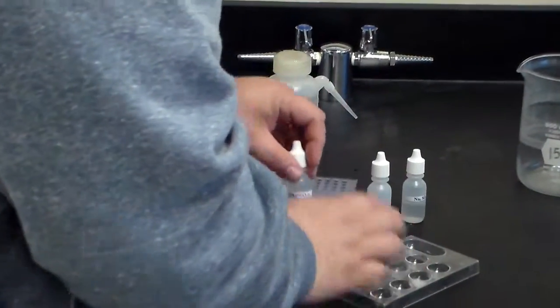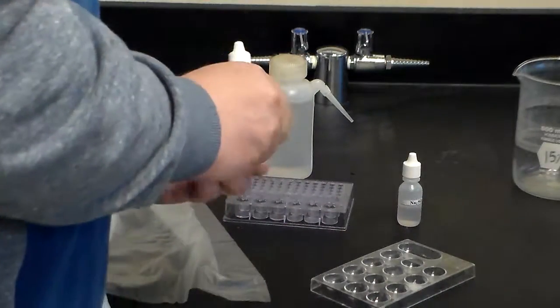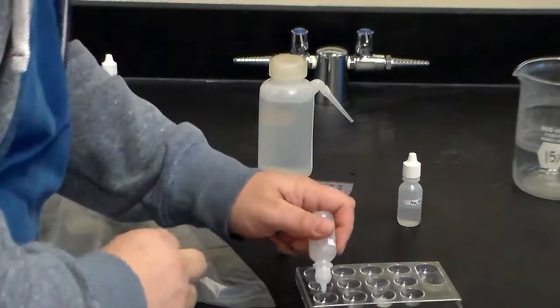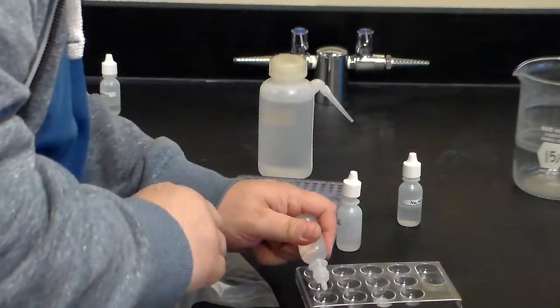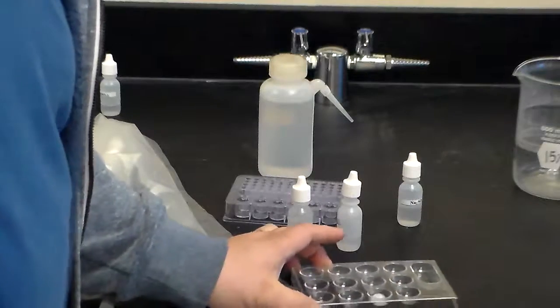Okay, well, what about barium and magnesium? Are we going to get a result out of that? Let's see. We're going to do the same thing. Now remember, these are all clear liquids, so I'm going to put it over here. Make sure it's clean. I'll put in a couple of drops here and put another drop here, and as far as reactions go, it's pretty quick, but if you look what I have here. You guys can see this? It is clear.